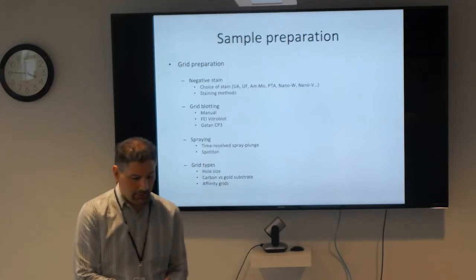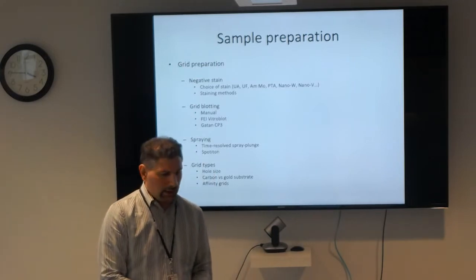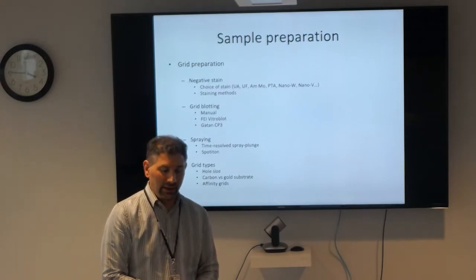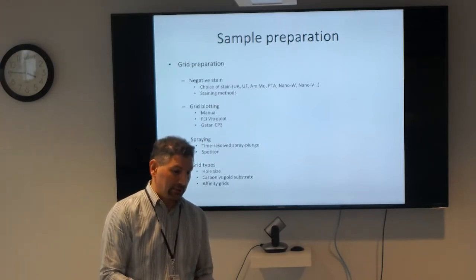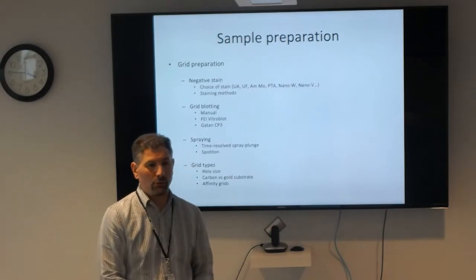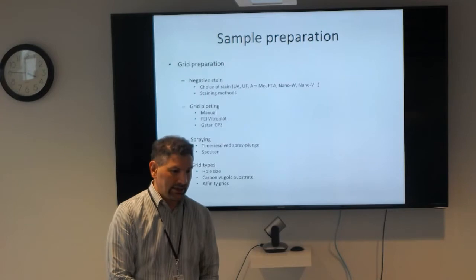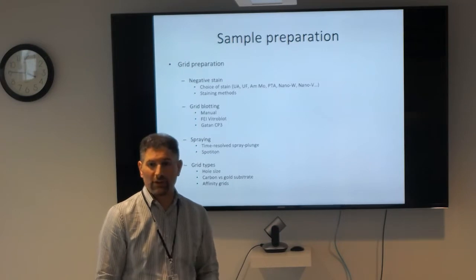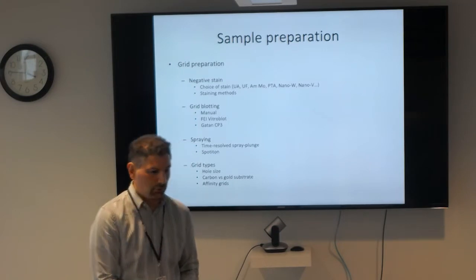And then grid blotting, when you finally do get into the cryo, again, some groups, I think Gabe Lander's group, go with the manual method. I think when he said it, I thought this was silly, but I mean, his entire grid looks gorgeous. So it's not the easiest way of doing it. It becomes an art. It takes a lot of practice, but his guys are getting these gorgeous grids left and right. So it's something worth trying.